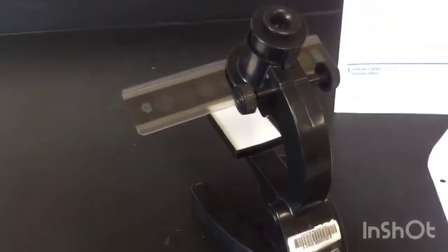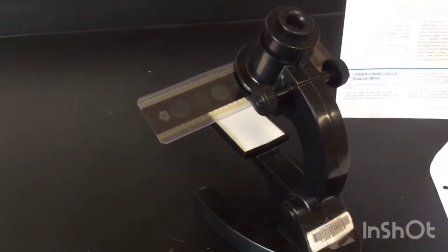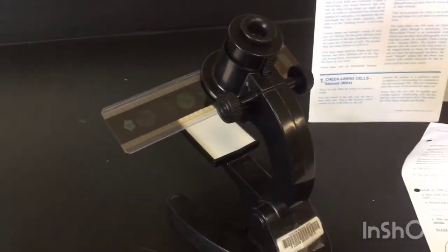And I don't want to forget about our microslide viewers. They are a great little resource. They look like a microscope, but they're really virtually unbreakable, so that makes them a great option if you're doing this kind of study maybe with late elementary or middle schoolers. You're certainly welcome to borrow the microscope, but this is a nice option as well.